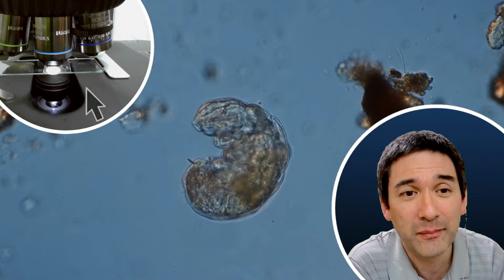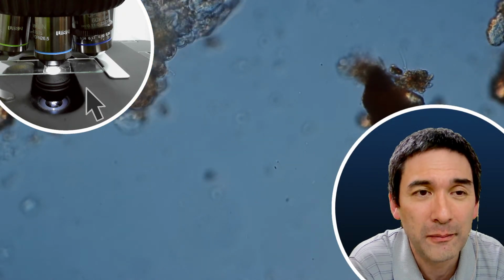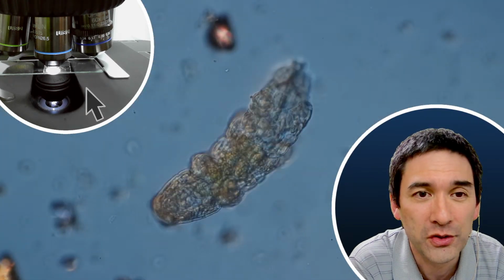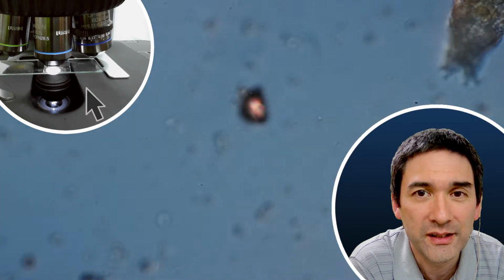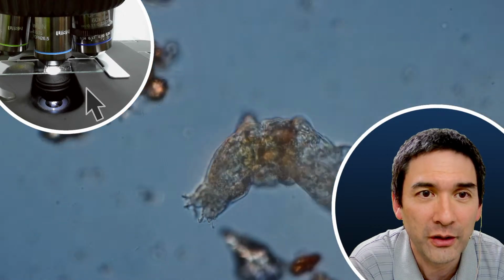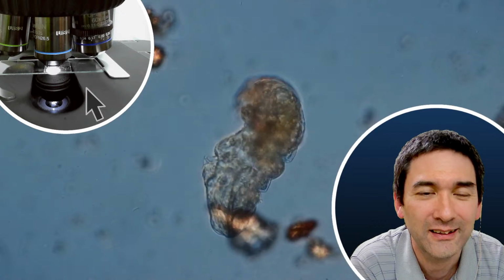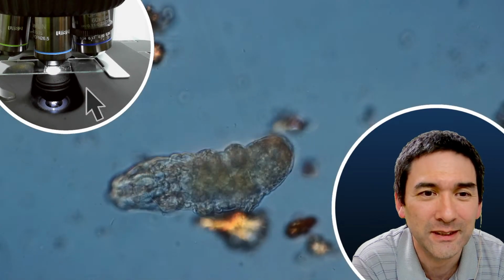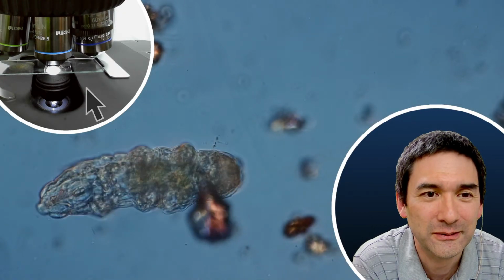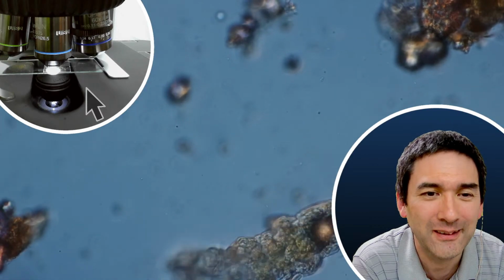But then again, I don't know if electron microscopy is so suitable as a hobby because of the elaborate preparation that's necessary. Now it's going off. Look at this. Let's see what it does now.